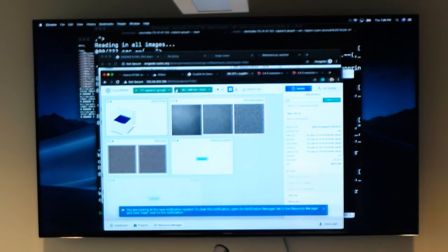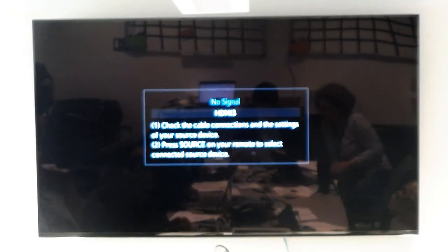D3? Is it D3 also? I think, I mean this particle, okay, let's put D3.